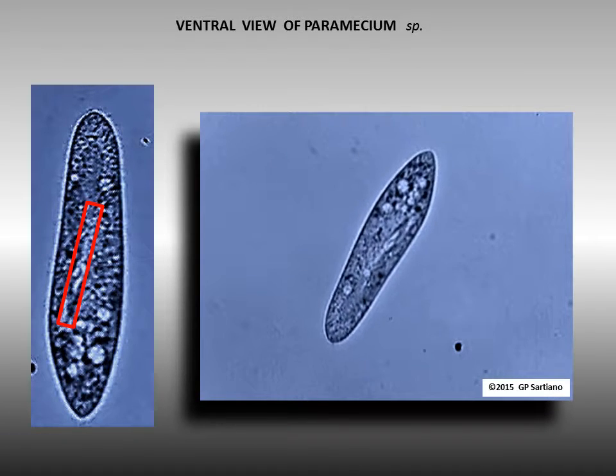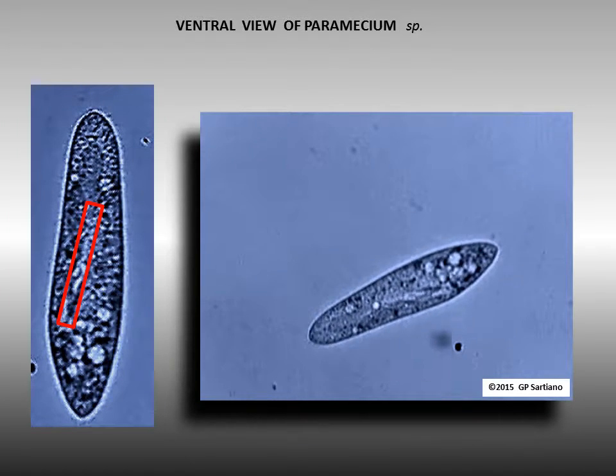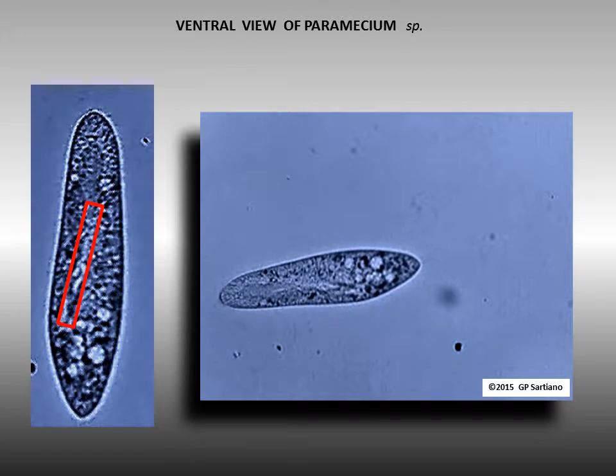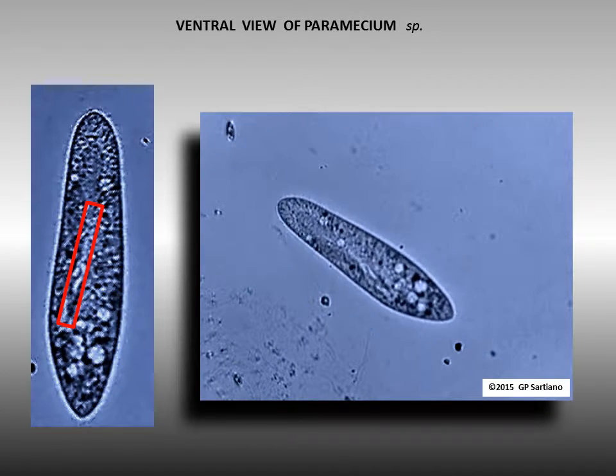And similarly, in this video, the coarseness of some of the cilia deep in the buccal cavity becomes quite noticeable.